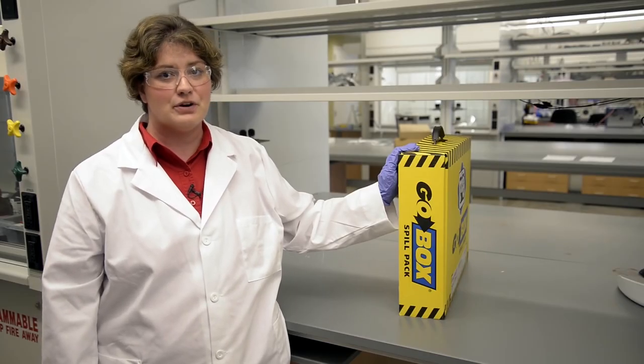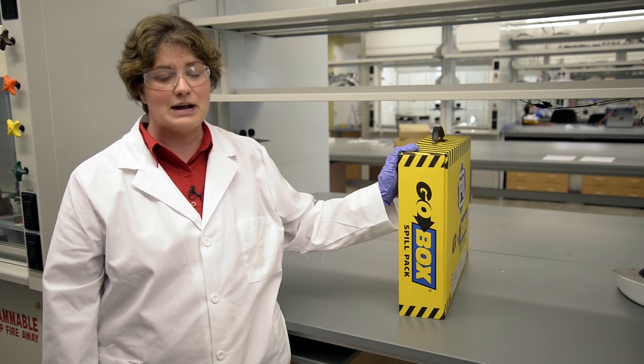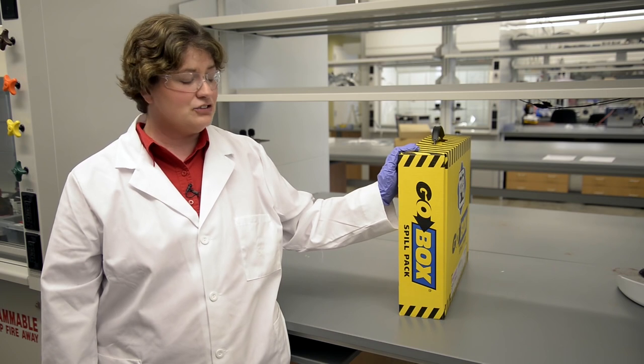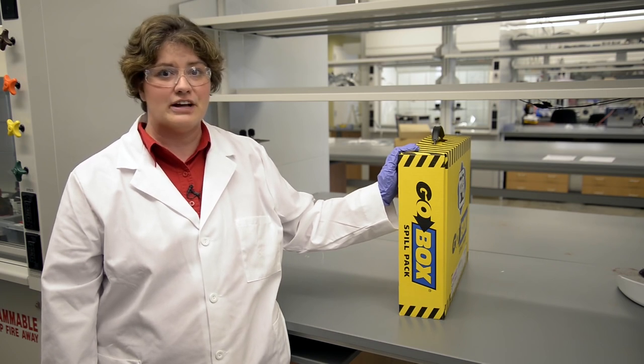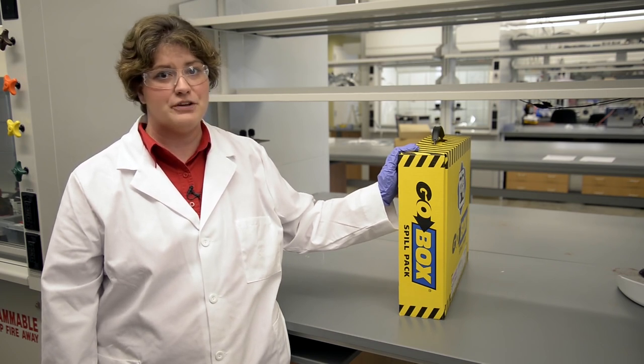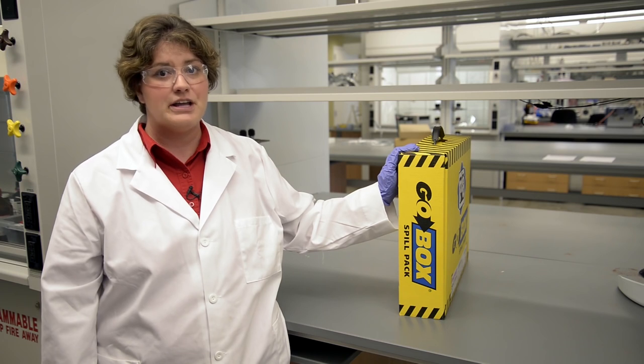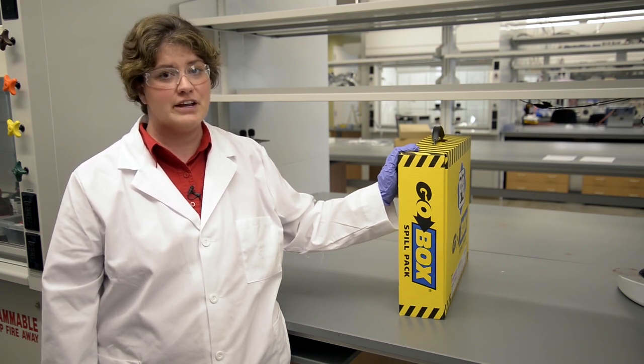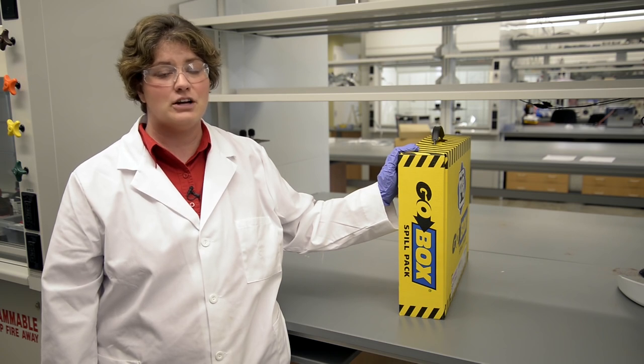Whenever there's a spill in the laboratory, the first thing you want to do is always alert your instructor or alert others in the laboratory so that they don't come in the area of the spill. Assess the situation and make sure you can clean it up yourself, and don't be afraid to call for help if you do need help cleaning up a spill. You can either call environmental health and safety, or if you need to evacuate the building, you could pull the fire alarm pull station located outside the laboratory.